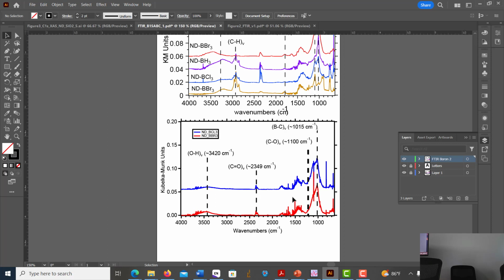I've never done it before. I've always done the smoothing in Igor, but I wouldn't be surprised if you could use one of the functionalities in here and delete out that hard line, that cosmic ray. Right now, it's selecting that area, and let's see what happens if I hit delete. It just deletes that particular section that was highlighted. I don't know the exact algorithm that's used to make sure that that particular section within that rectangle is eliminated, but that's how it's currently set up.